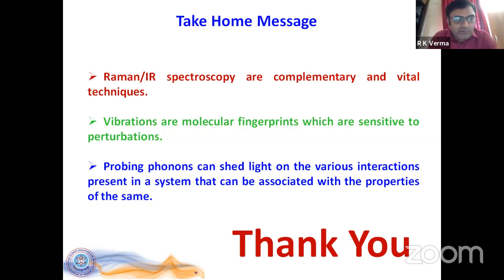Jyoti is asking how energy conservation is possible in anti-Stokes lines. Well, energy conservation is happening in all the processes, if you see the total picture. Let's say, for example, I shine a laser light and put it on a sample. The laser light is going to give some energy to the sample and is going to create a phonon. So there's a small amount of energy which is transferred onto the sample. But if you see the total energy, it is the same.